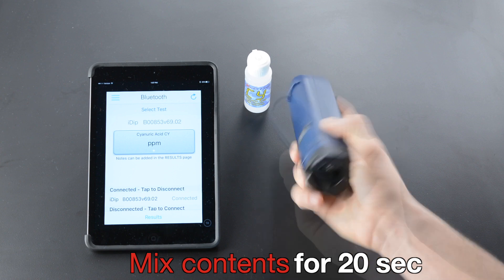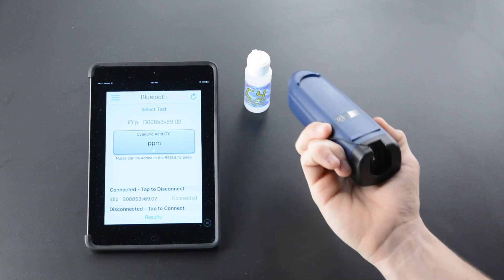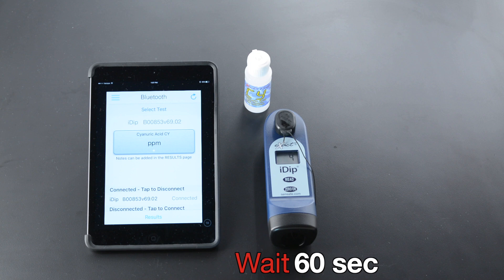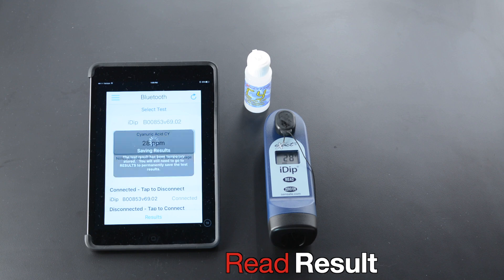Mix contents for 20 seconds. Wait sixty seconds. Read the result.